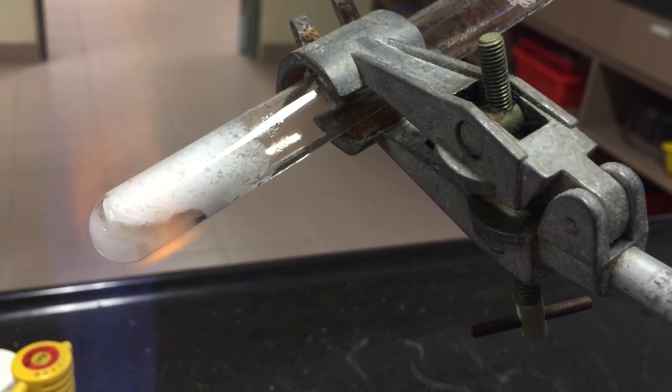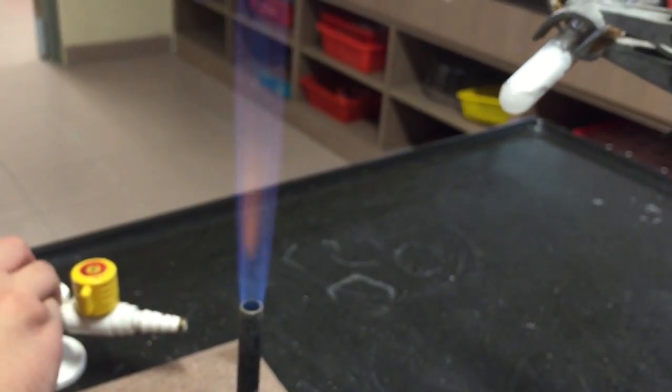Once you see that the bubbling is stopping, it shows that all of the water has been forced out of the calcium nitrate crystals. You can then proceed to strong heating.